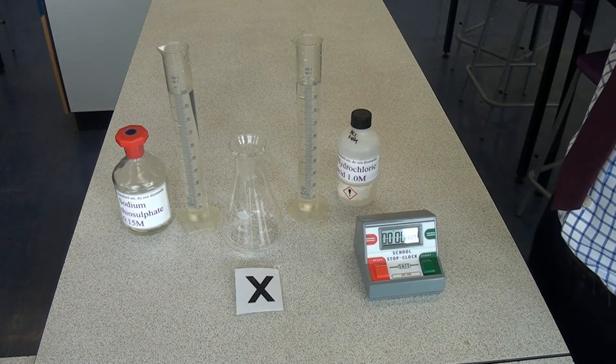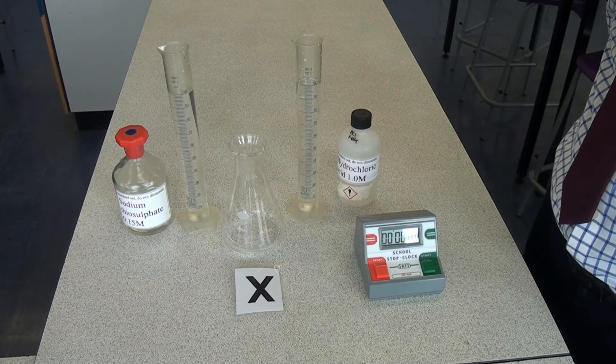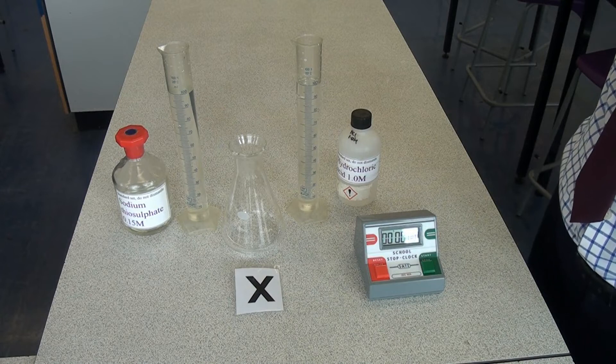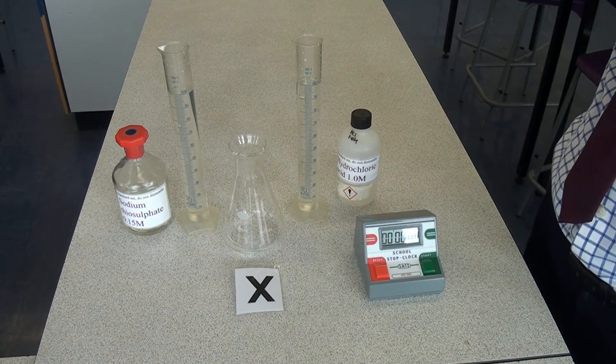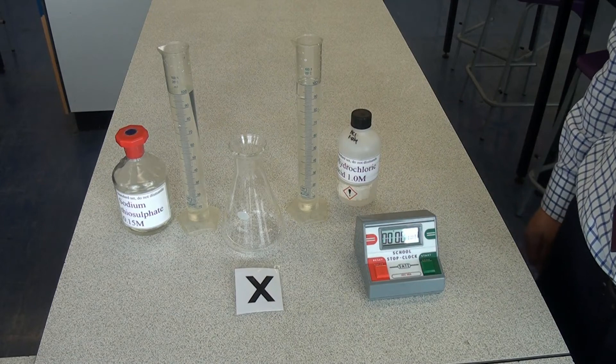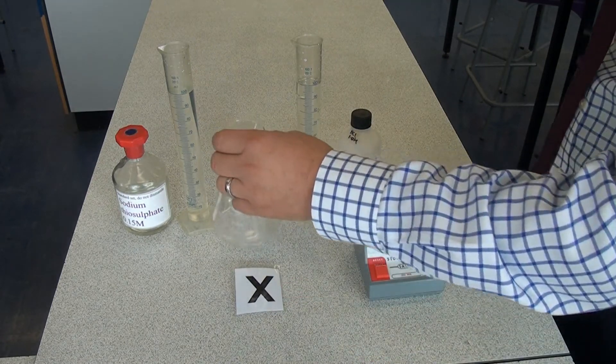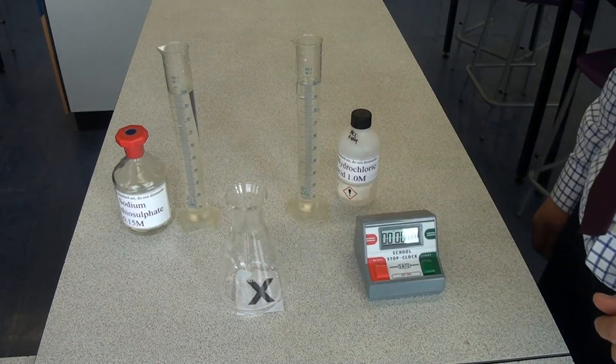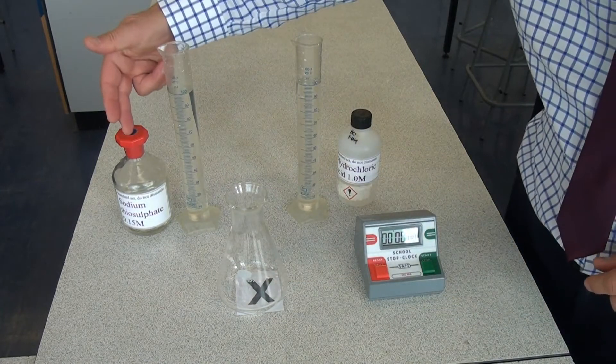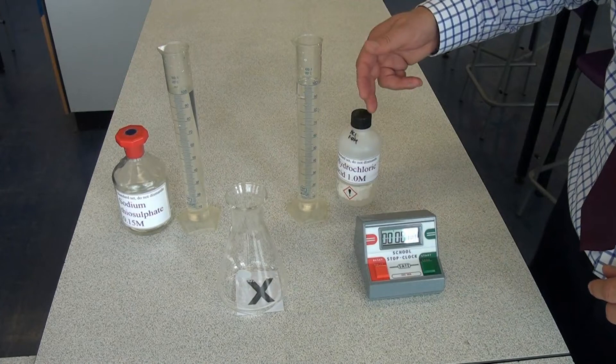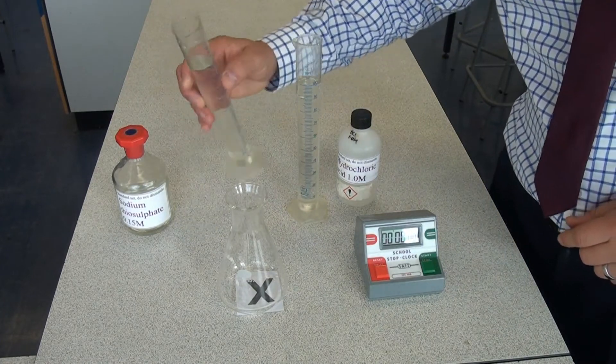We've already mentioned that sometimes a solid is made in a chemical reaction. So in that situation, how can we measure the rate of reaction where there's no gas being produced? Well, I've got here a cross marked on a piece of paper and I'm going to stand the flask on top of it. I'm using sodium thiosulfate and hydrochloric acid. So I'm going to pour the first reactant in.